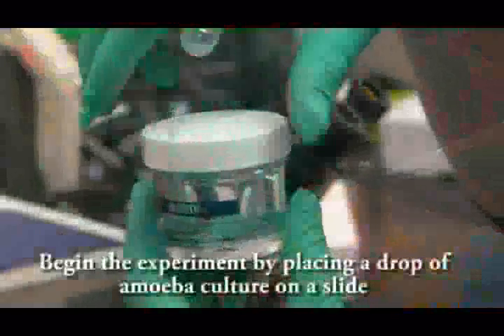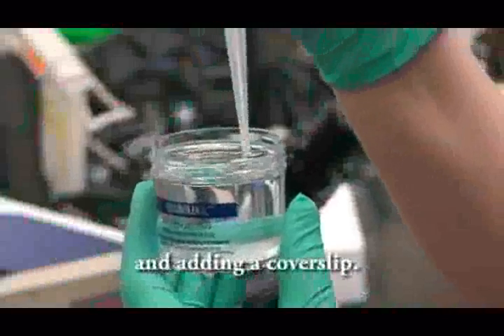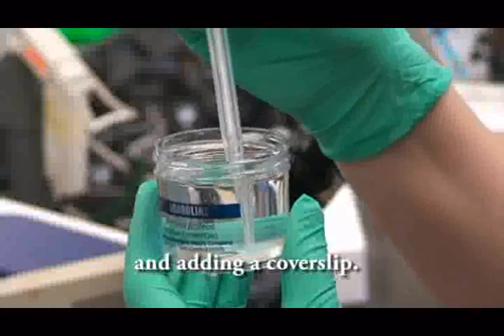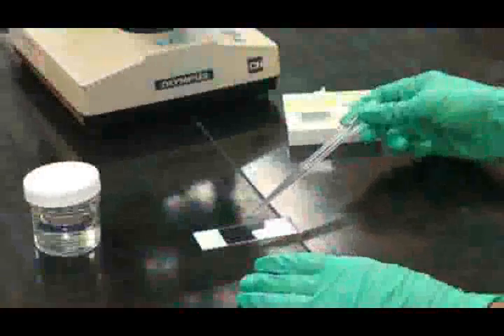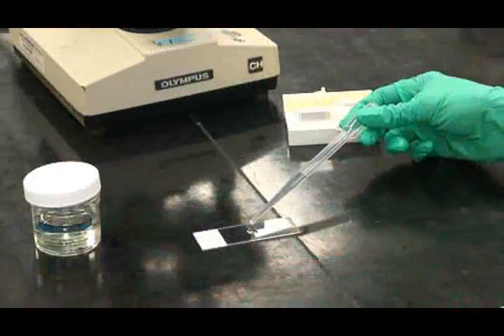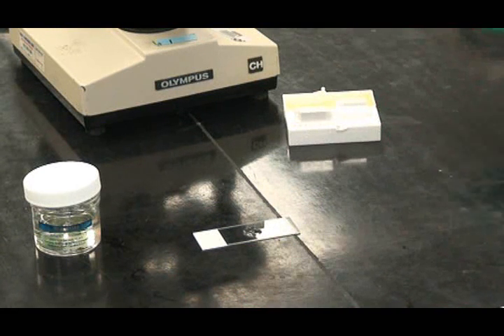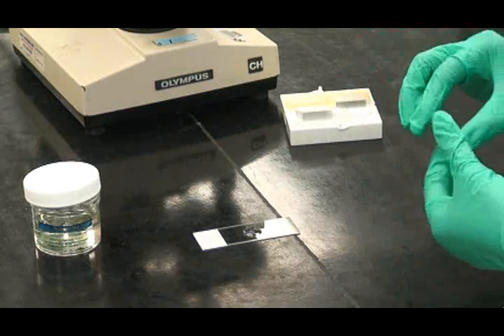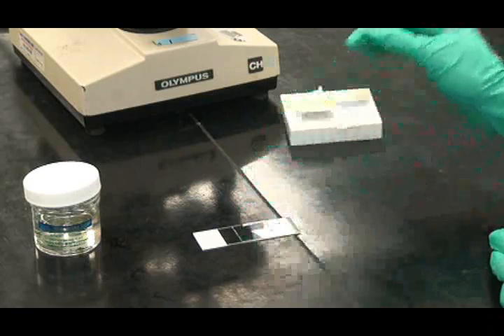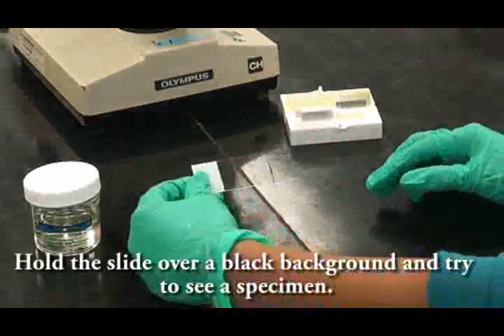Begin the experiment by placing a drop of the amoeba culture on a slide and adding a coverslip. Hold the slide over a black background and try to see the specimen.